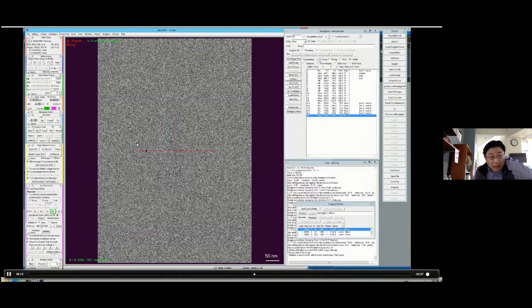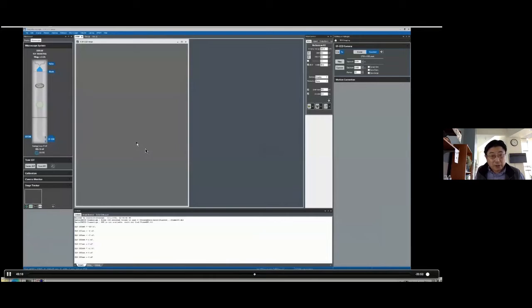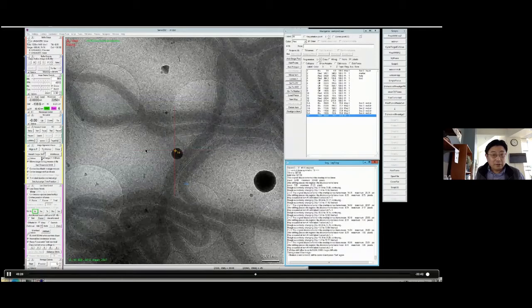So again, I want to show you one more thing, which is where the focus area is. The focus area is off, I think. Okay, so here's the focus. This is going to be my record mode center, and the focus area is off about 2 micron. I use this for tracking purposes for focus, and this is going to be my area of data collection.